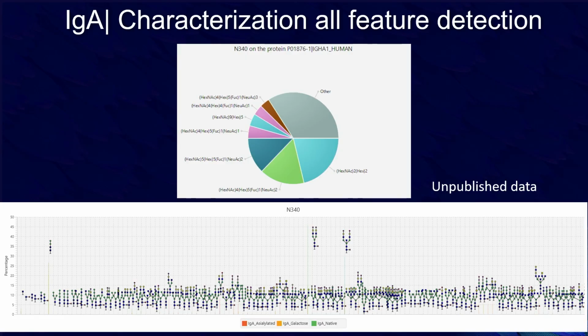I really love this representation. It tells you how complex this thing is. I think that will be my favorite slide when I go to a conference where people start talking about RNA sequencing. I usually would show this particular slide and tell them good luck with RNA sequencing. This is just a single protein and a single site, and that's how complex this thing is. And it just immediately picks which exact particular sugar types you would like to look at as a most possible drug target.